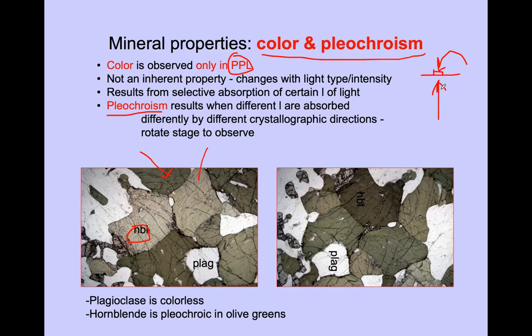They have different amounts of light absorbing when it reaches the mineral, because these minerals are having different crystallographic orientations. So when you rotate the sample, based on this crystallographic orientation, because you know there are different crystal directions, when you rotate this crystal into another direction, your original features will be lying like that probably.